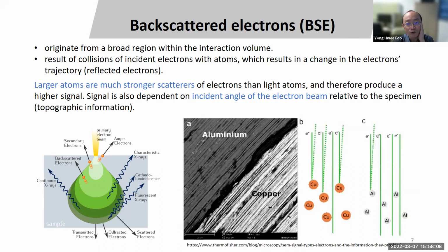They have very high water content. Those will actually shrink even in the low vacuum. We had a user who cut out a piece of agar and placed it under, and after half an hour the agar starts to crack. So those are considered wet or hydrated samples. But for cells or tissue that are already air dry or PFA fixed and there's not much moisture content, I think that shouldn't matter that much. Okay. Thank you very much.